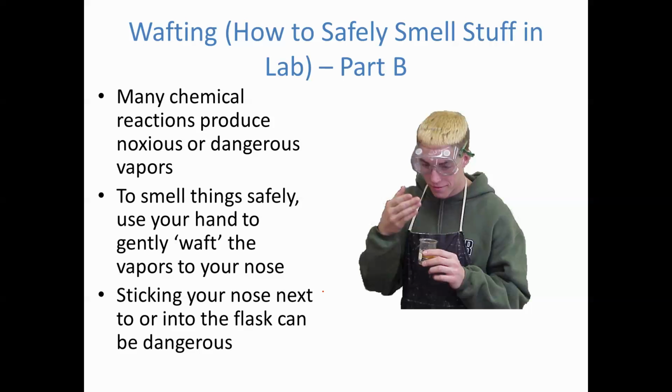So moving on to talking about part B, one of the things that's going to be very important here is how you smell the chemicals. If I remember correctly, part of the procedure calls for you to identify what sort of smells are coming off the container. And so you want to avoid sticking your nose into the flask. If you stick your nose into the flask or near the flask, that can be very dangerous. That can actually injure you or poison you or burn you, so don't do that.